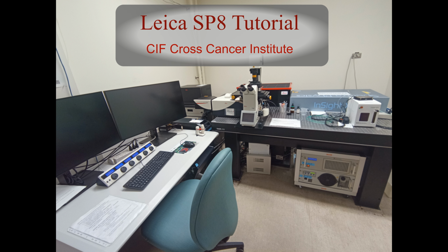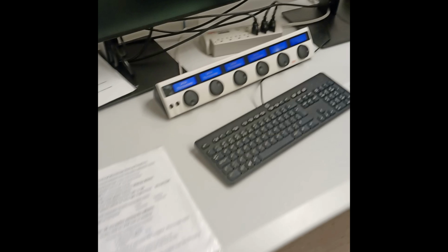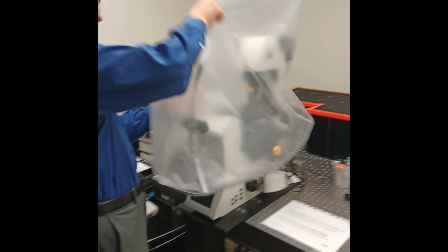Welcome to the Leica SP8 tutorial of the Cell Imaging Facility Core at the Cross Cancer Institute. This tutorial provides you with the instructions for basic use of the Leica SP8 for confocal microscopy. If you are the first person to use the Leica SP8 for the day, follow the provided startup instructions.